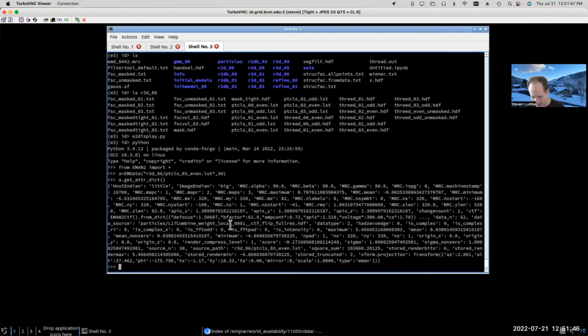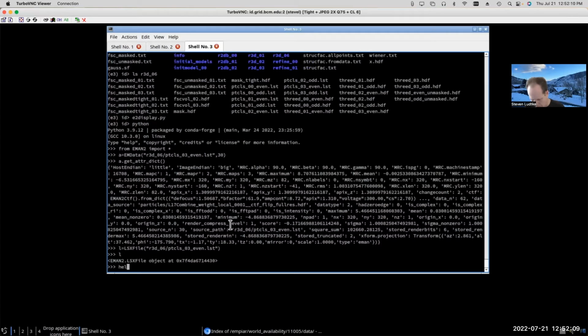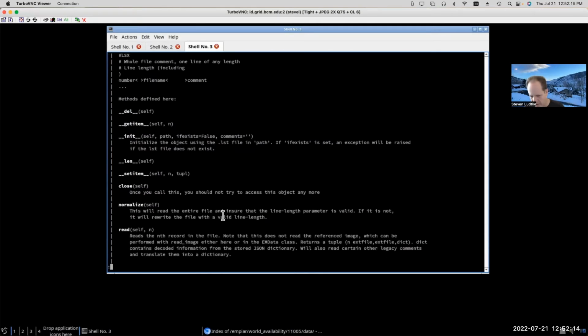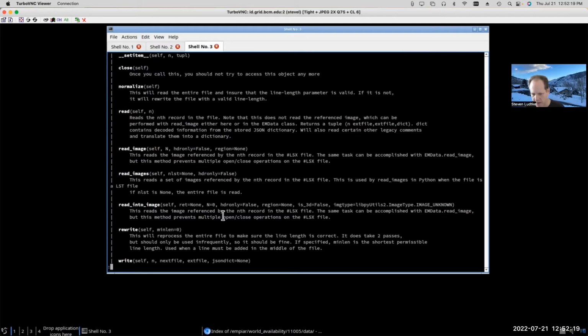So there's a class called LSX file. We'll call this LSX file, R3D06 particles 03 even.lst. And this will create an instance of a class, which will allow us to access the contents of the LST file itself, to manipulate the LST file.